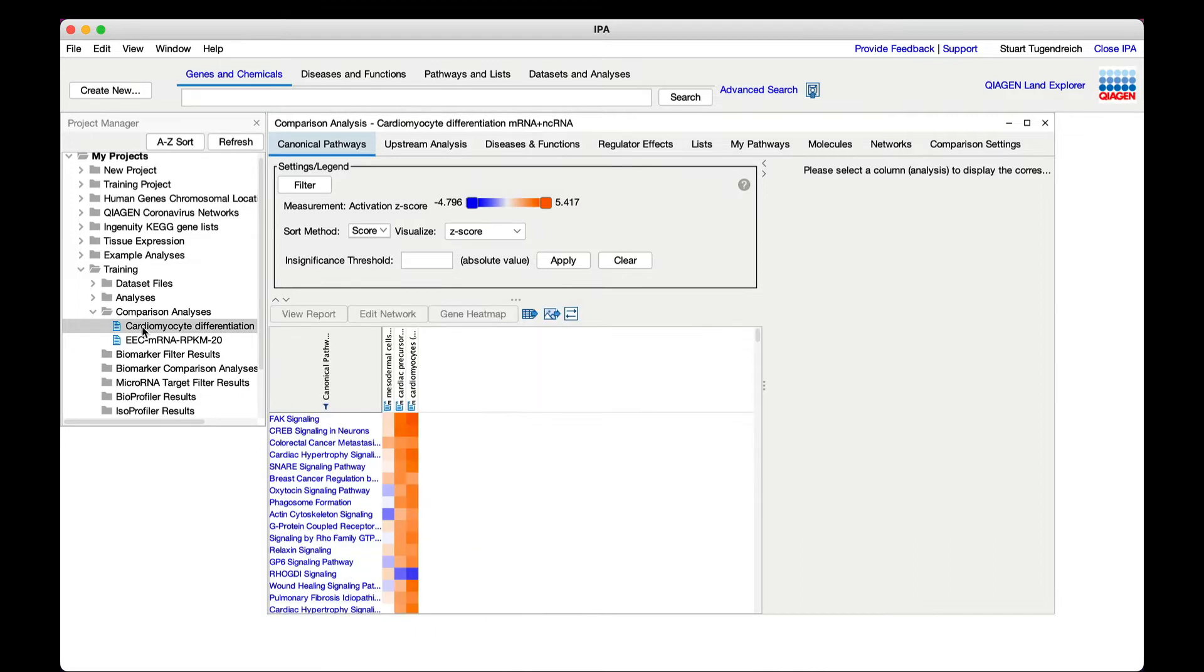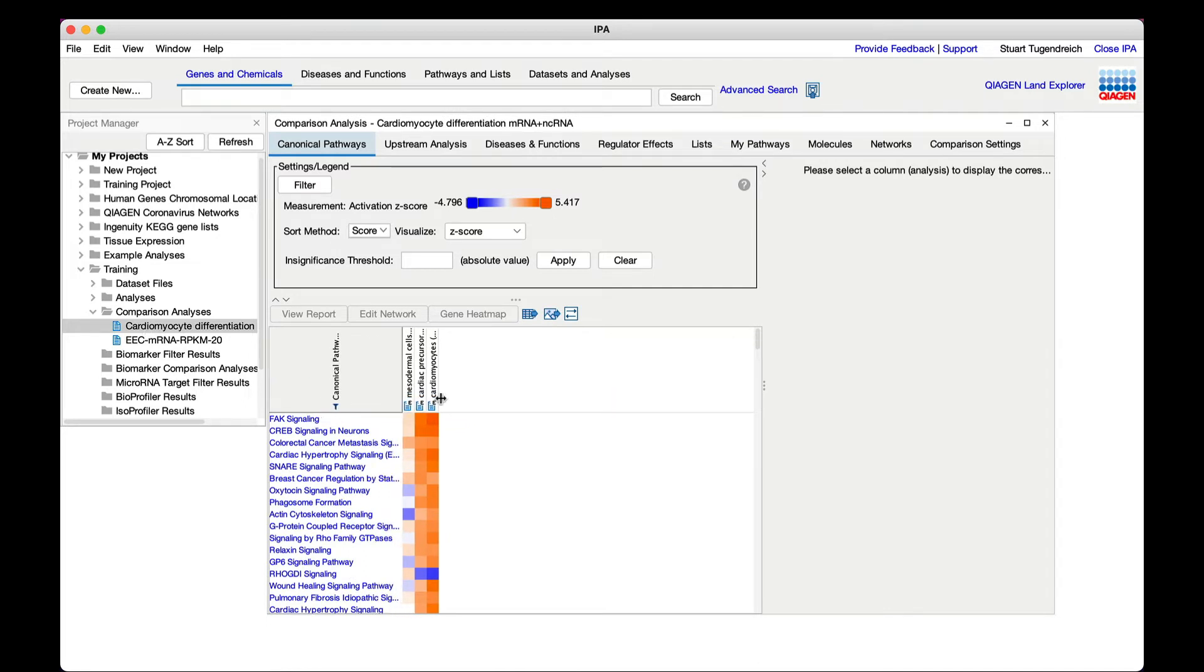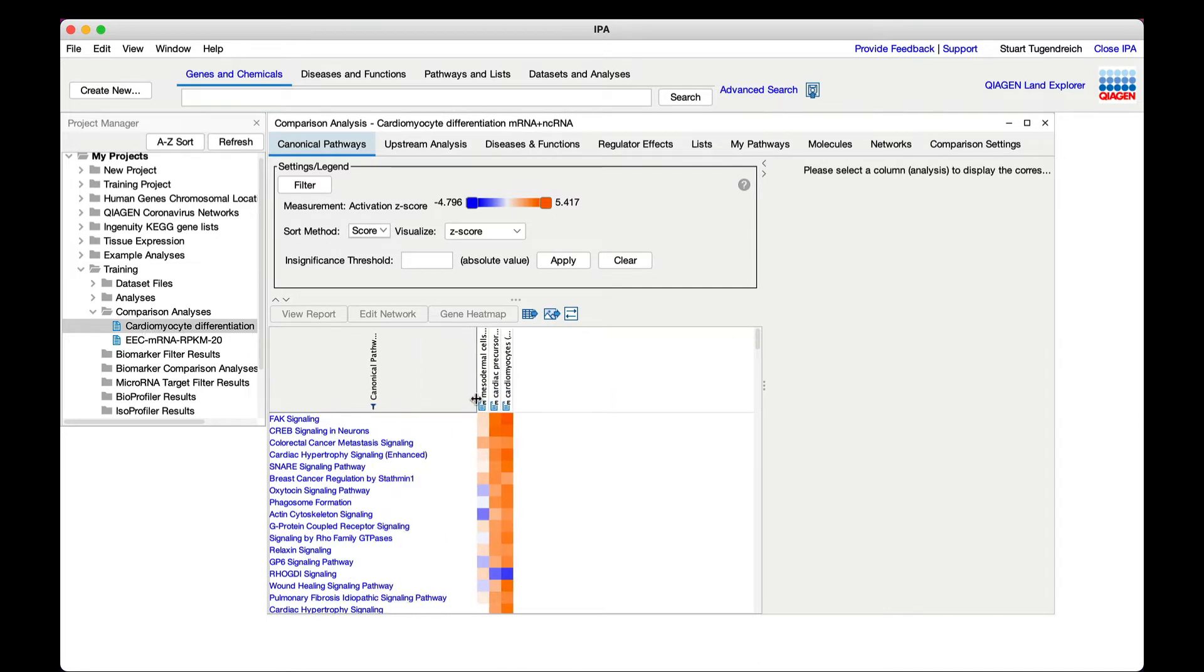Open the cardiomyocyte differentiation file in the comparison analysis folder. In the canonical pathways tab, sort by trend plus score.